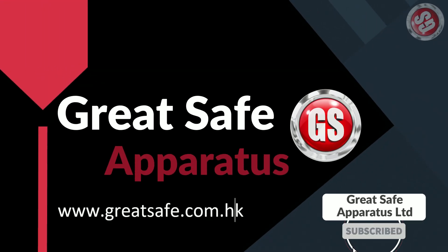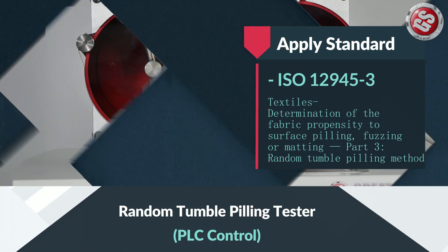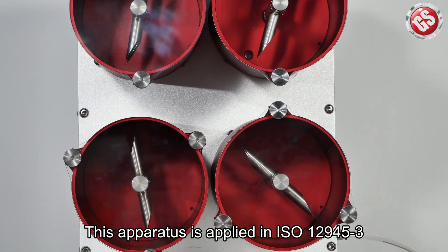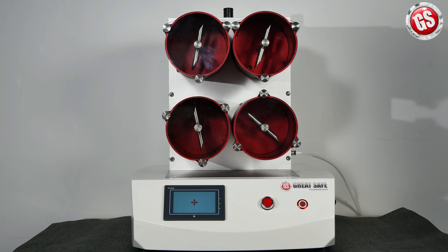Welcome to Great Safe channel. In this channel we will show you the testing machine operation. Now I will show you the random tumble pilling tester. This apparatus is applied in ISO 12945 part 3. Our smart control system has English and Chinese interface.